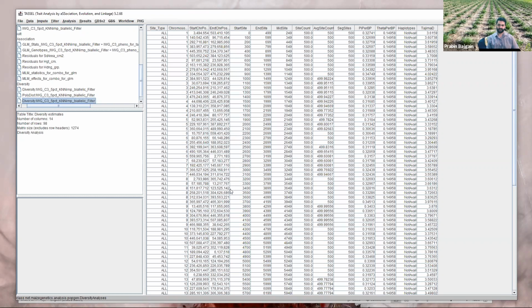It's all there. And it's essentially TASSEL, because the postdoc who is now a faculty at, I think, Illinois, he used to be at Cornell, not sure if it was Buckler Lab, but they do very similar analysis. I want to use FarmCPU, but have not gotten there because I haven't done GWAS lately. But that's another very common one. People also use rrBLUP for quick and dirty GWAS.